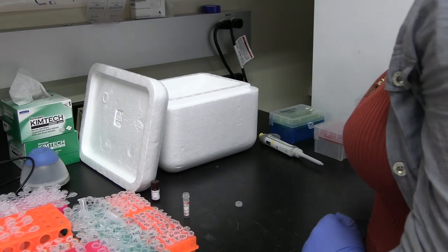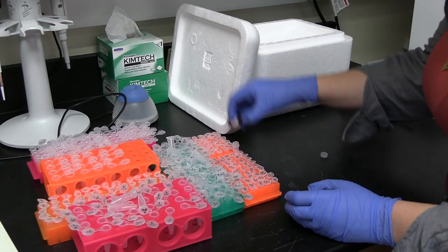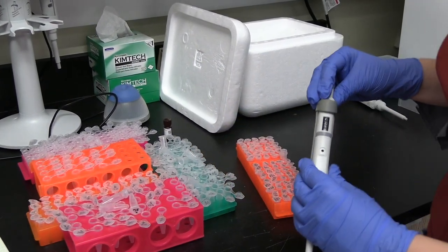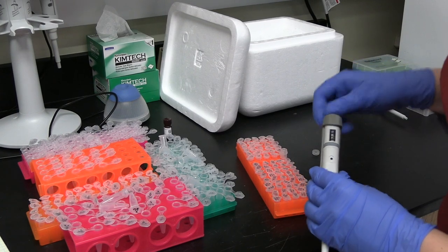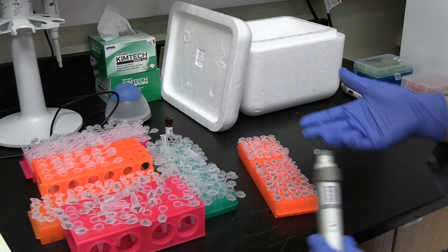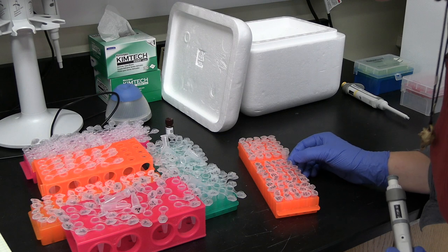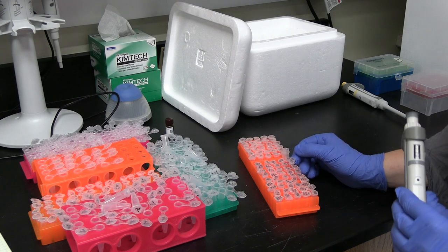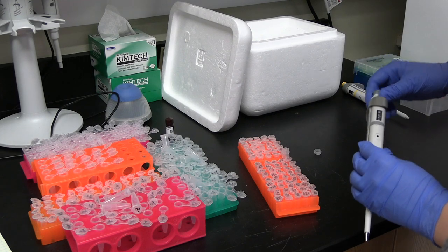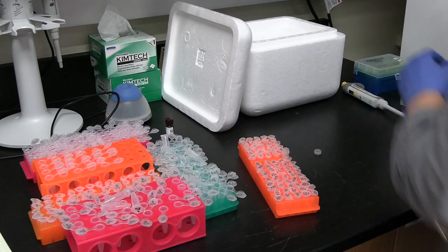So I keep my stock over here. I can even put it in this tube rack to just keep it stable. And what I'm gonna do is I set my small pipetter to 2.5 microliters. And then I labeled all of my tubes in advance, or Allie labeled all my tubes in advance. Just a short title, we put Atto 488 pH. This is Atto 488 phalloidin.